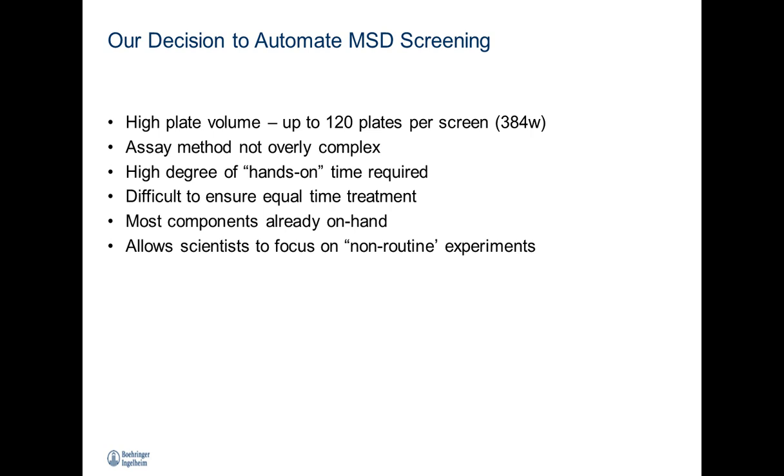Most of the components that went into the design of this platform we already had on hand from a previous platform. And as I've said previously, a walk-away automation platform such as this allows scientists to focus on non-routine experiments, assay development for other projects, that sort of thing.